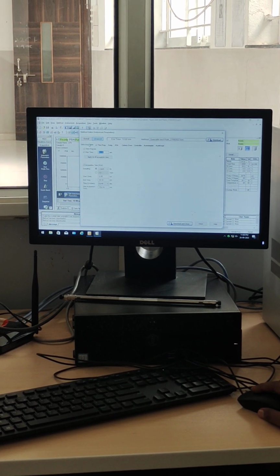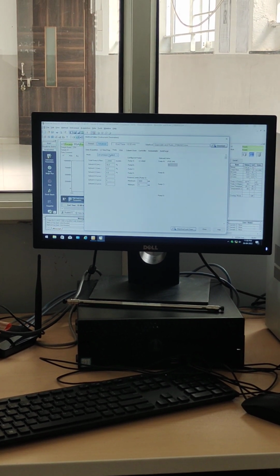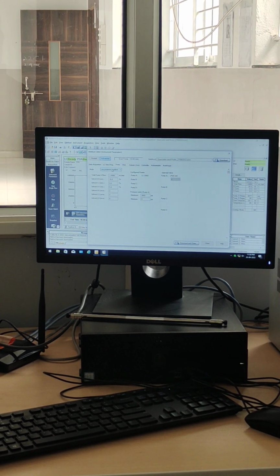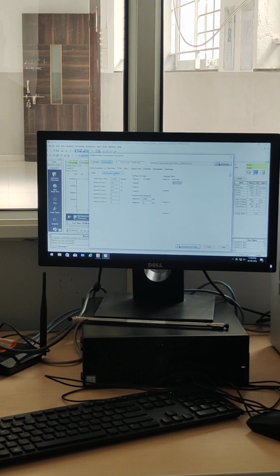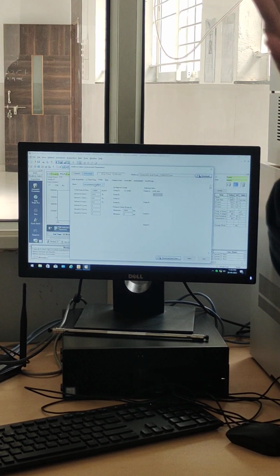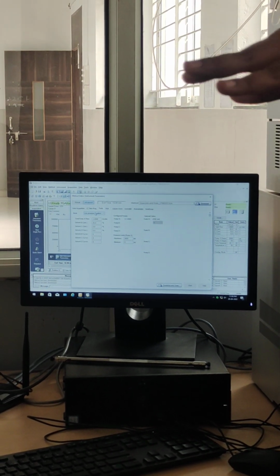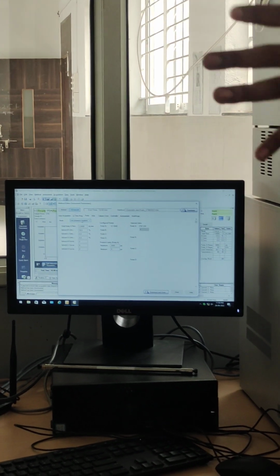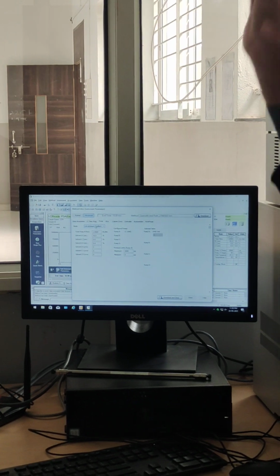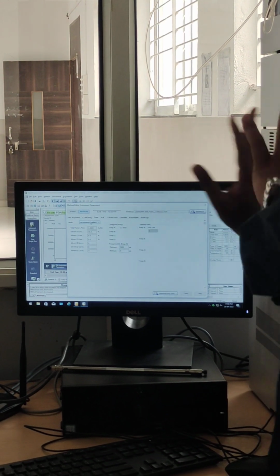And LC pump system, which system do we have to use there? Because I have added A port methanol, B port water, and then I have optimized one method. Method development system is also available. If you know method development parameters, you studied QA: method validation, accuracy, precision, robustness, ruggedness, LOD, LOQ. These are the validation parameters. Before that we have to create the method, and that method we have to optimize. Now I have made the method and optimized it, and that method I have loaded here.